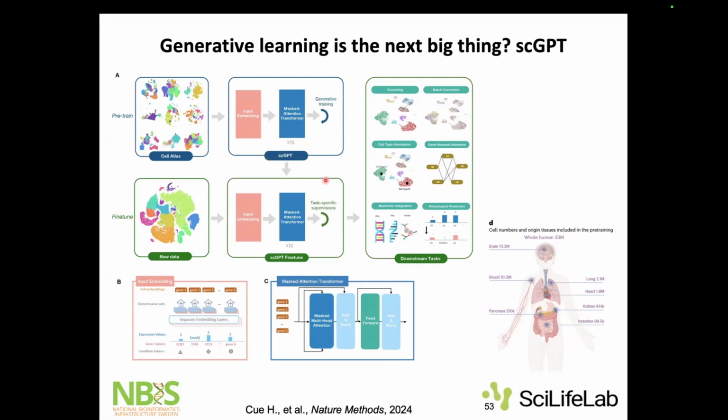Give it to an extra neural network there to assign the label. So you add another layer of classification there, and you assign the cell type annotations. This used a huge number of cells, like 33 million cells across different tissues. They have a very huge data set there.